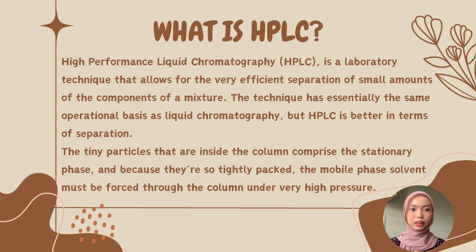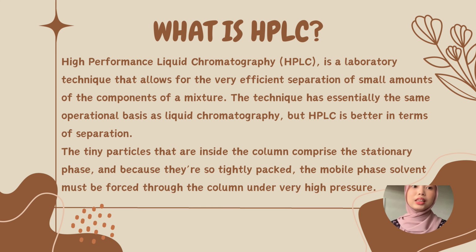Let's start with our introduction. What is HPLC? HPLC, or high performance liquid chromatography, is a laboratory technique that allows for the very efficient separation of a small amount of the components in the mixture. The technique has essentially the same operating basis as liquid chromatography, but is better in terms of separation. The tiny particles that are inside the column comprise the stationary phase, and because they are so tightly packed, the mobile phase solvent must be forced through the column under very high pressure.